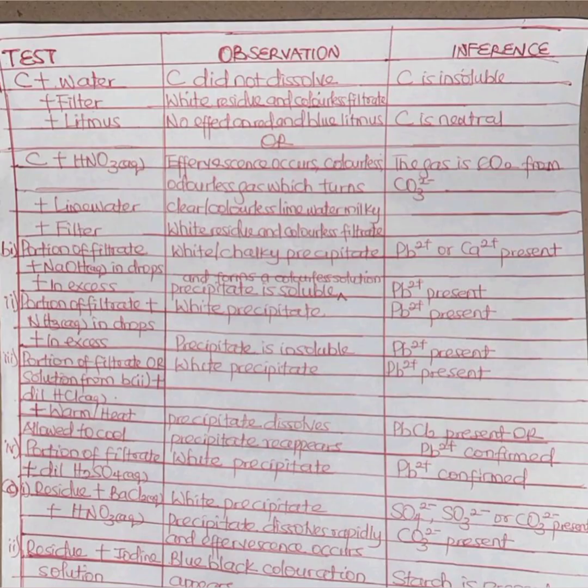This particular video is for possible questions on question 2 in the WAEC 2026. We were given lead carbonate, PbCO3, and starch to provide as our specimen for C. Obviously, we can create all the possible questions by knowing the specimens. So this is for the students and for anyone who would like to understand or to listen. Now let us proceed.